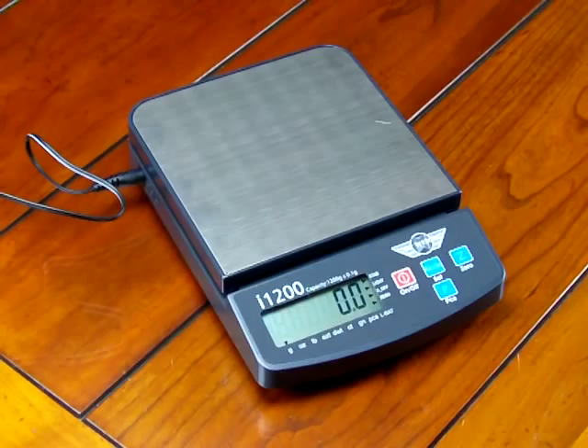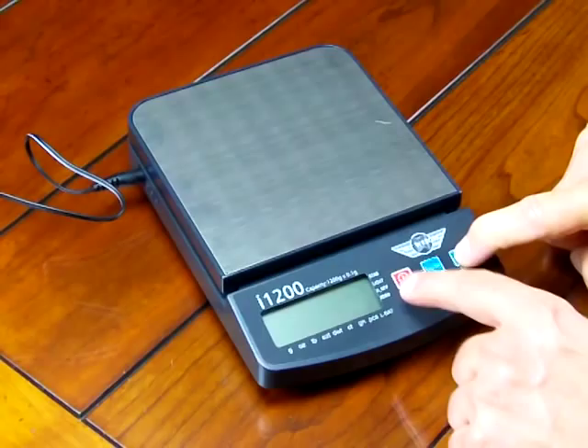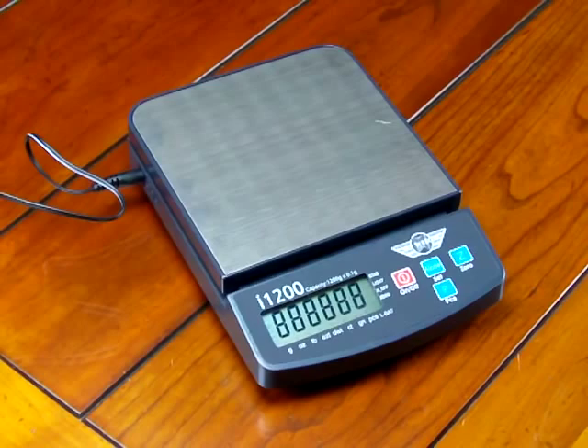It's very simple to do, but you have to have the optional calibration weight. To perform the calibration, we're going to turn the scale off and hold down the zero key while pressing the on key, then release. The display shows all eights, then we're going to get a random number off the A to D converter.